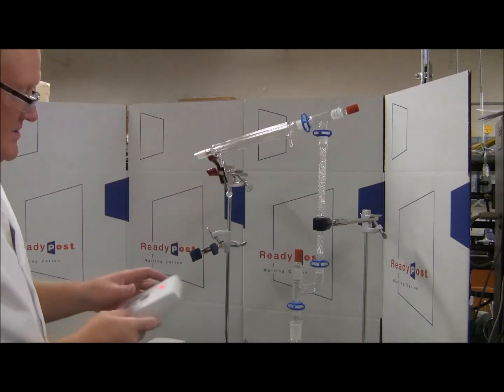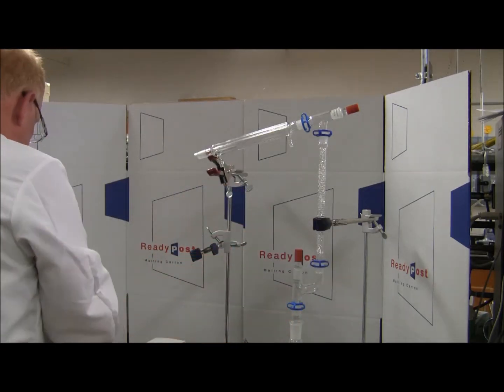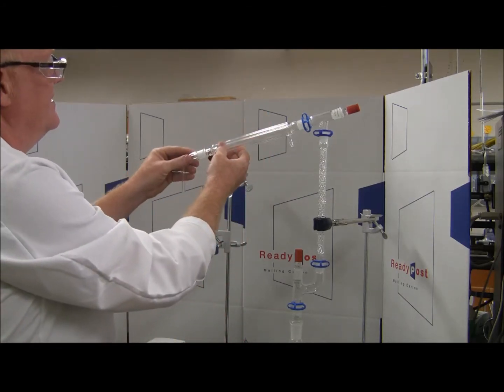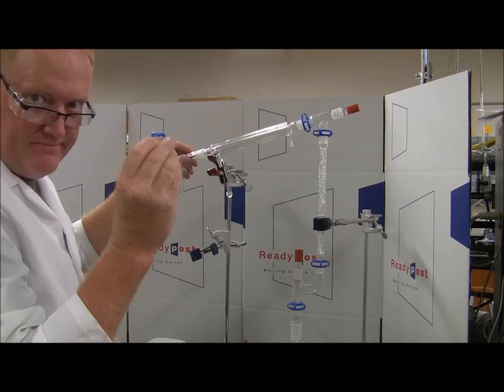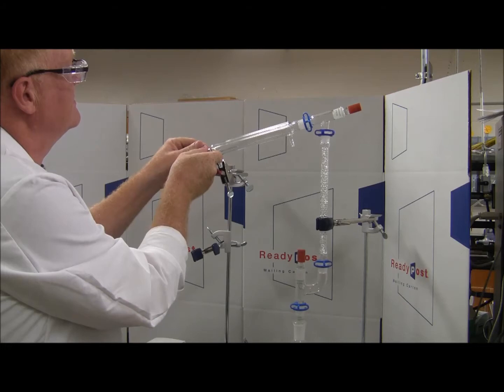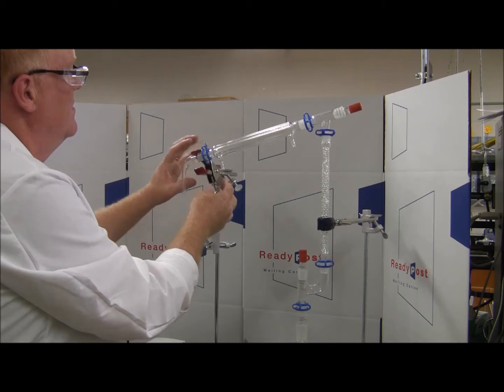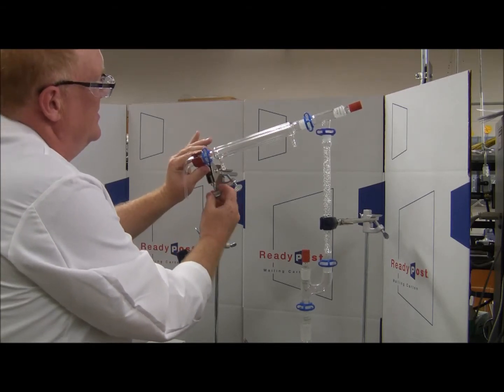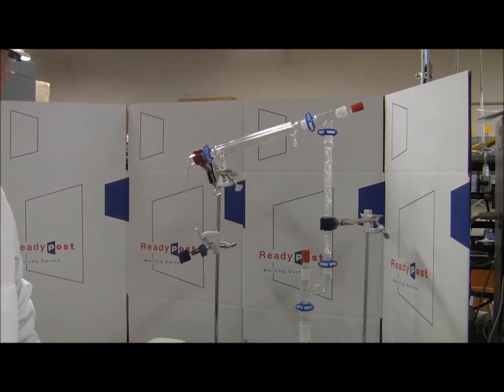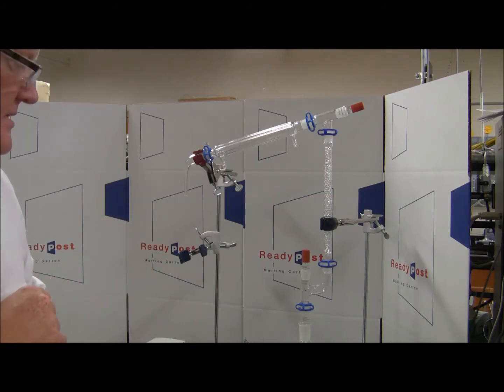The last of the glassware is going to be the 105-degree distillation adapter. This part right here. It'll fit on the end. And yes, once again, blue clip. Secure this in the stand right here. Okay, the glassware portion of the ethanol apparatus is complete at this point in time.